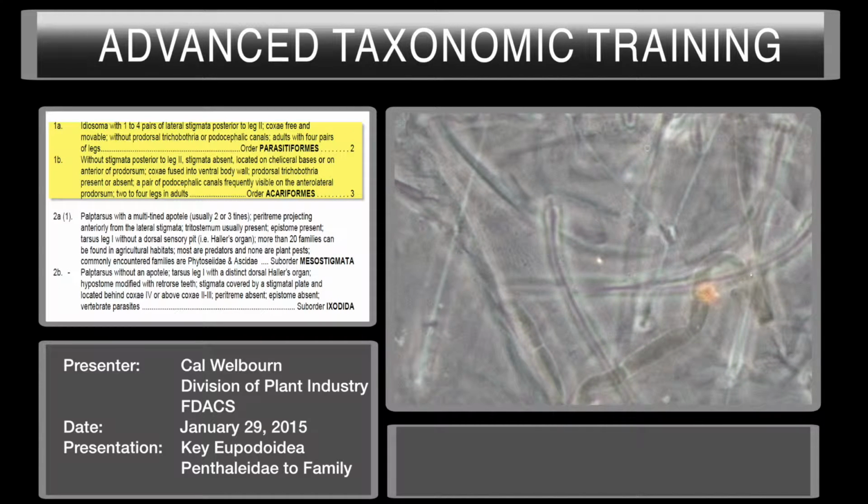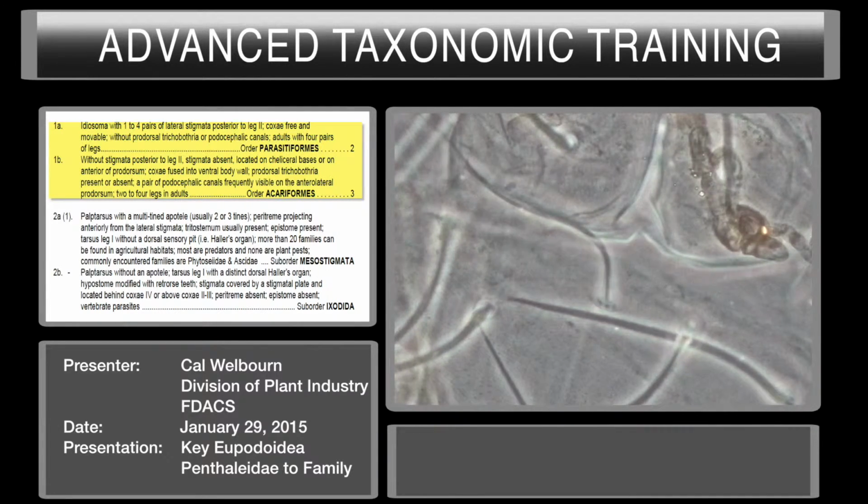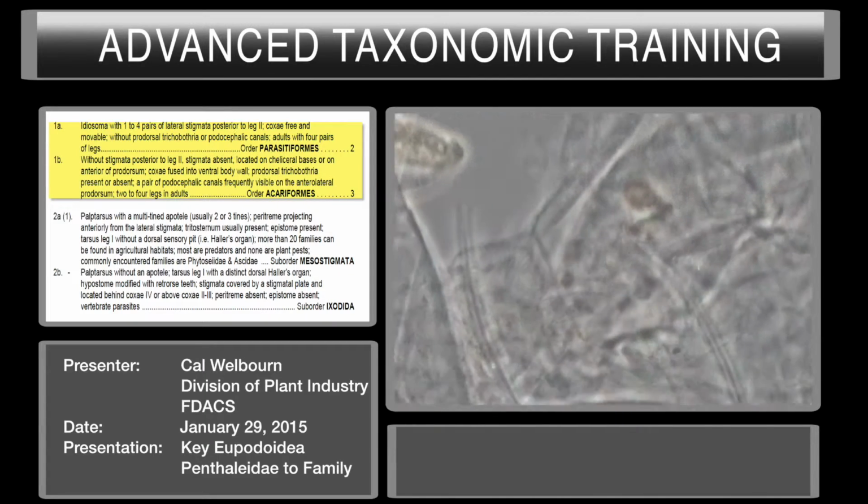Let's see if we might be able to see the podocephalic canal if it's present. That's ventral.